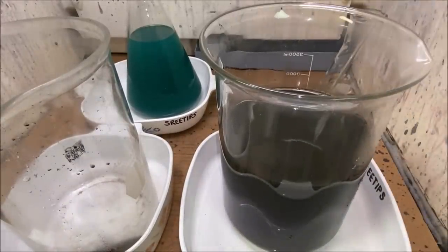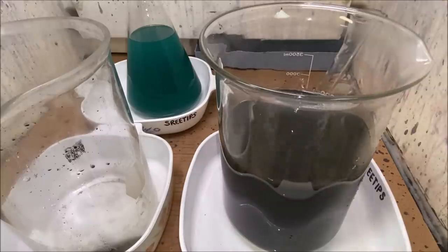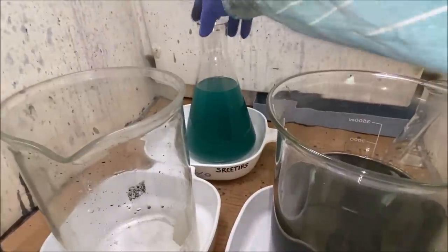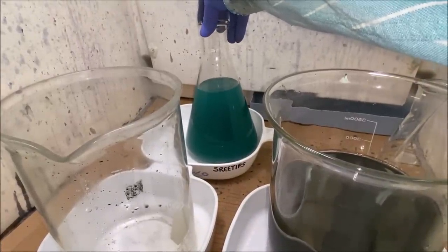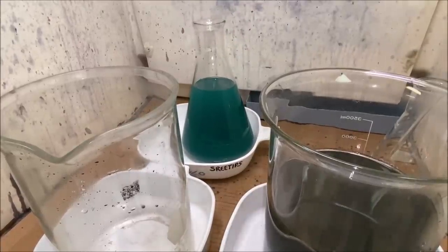I'm going to let this settle out. And we'll recover the liquid because it's going to have some silver. And then back here is our silver solution that's going to have a whole bunch of nitric in it. And what we'll do is we'll filter this. And then we'll go from here.